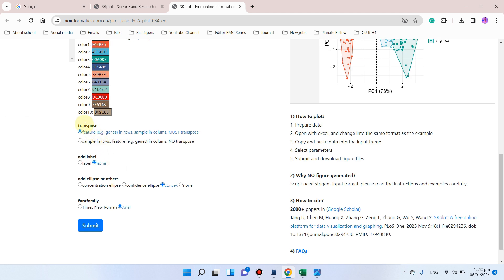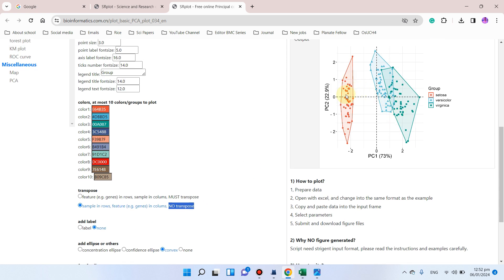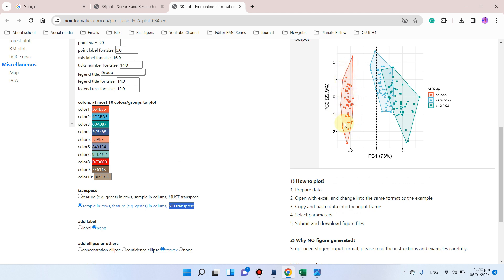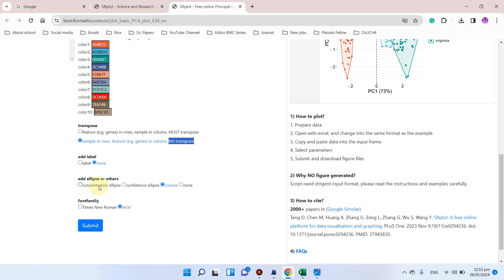Here is an important option: you need to select which form your data is in. Since we pasted our data with samples in rows and features in columns, we select the 'columns' option without using transpose. You can also choose whether to add labels to each point, and whether to add an ellipse — either a confidence ellipse, convex, or none. I recommend selecting none for now.